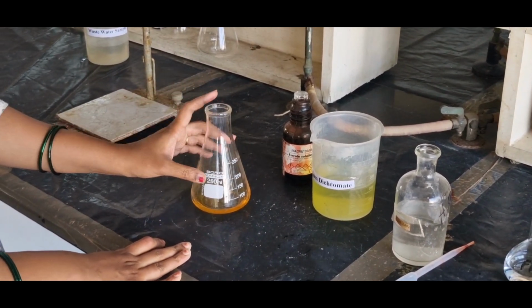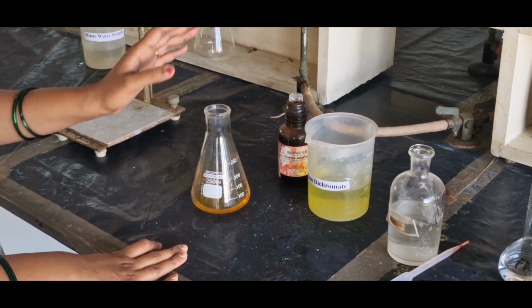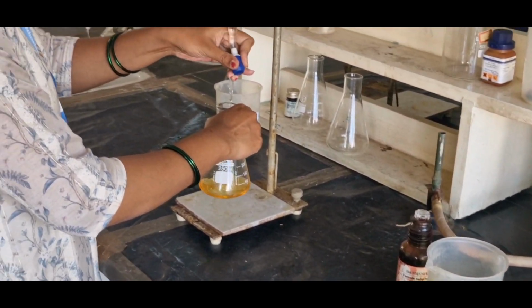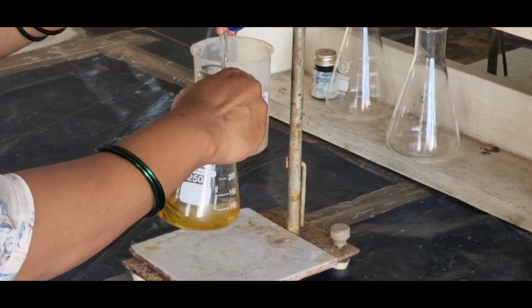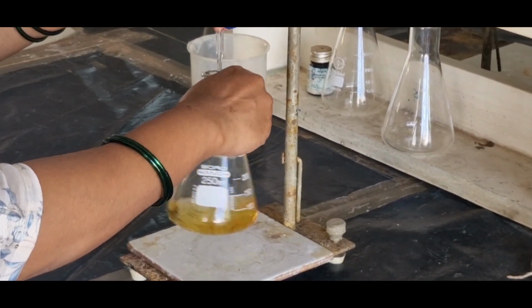This titration is used only to know the reaction of K2Cr2O7 with the FAS. So in this we will come to know the exact volume required for the reaction of only K2Cr2O7 with the FAS, excluding the water sample.